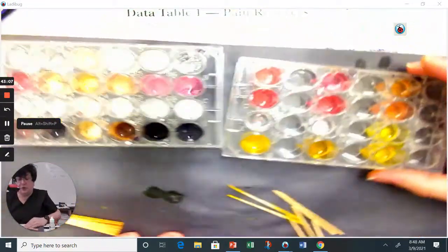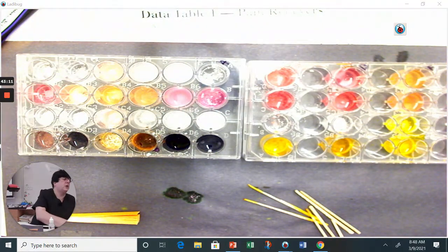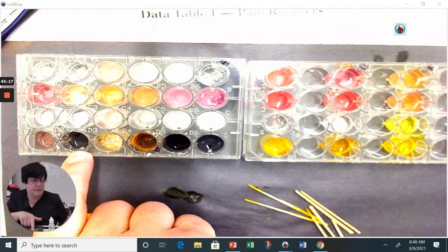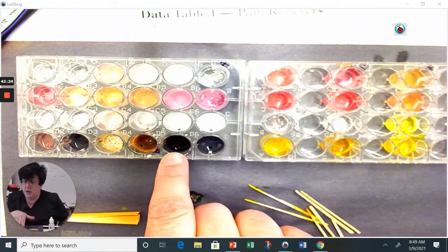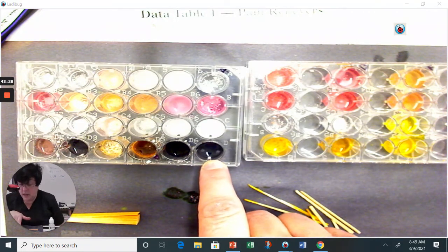None of them match up perfectly, so you're just going to try to pick the one that you feel you can match up the best. Right? So remember, this is aspirin, acetaminophen, ibuprofen, Bufferin, Excedrin, and then we have our unknown A.